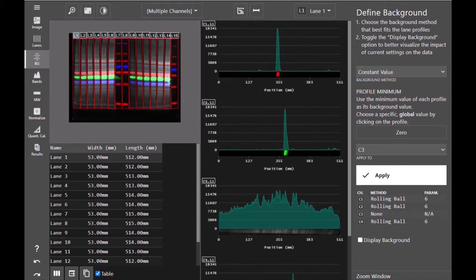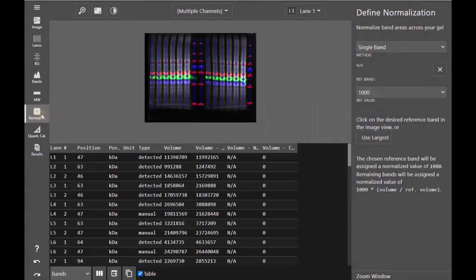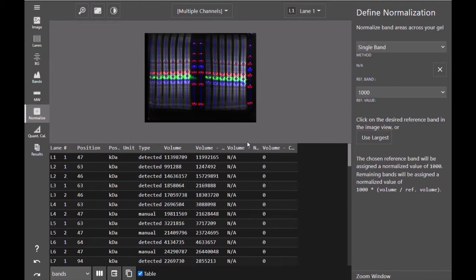Once you have subtracted your background and defined your bands, you can move on to normalization. Azure Spot Pro offers several different methods for normalization.